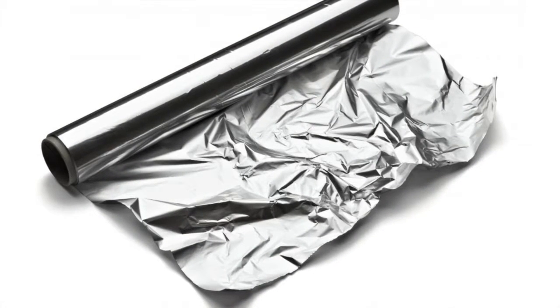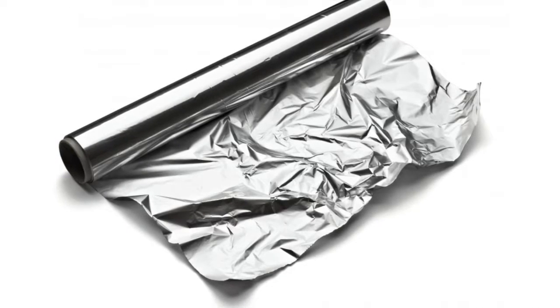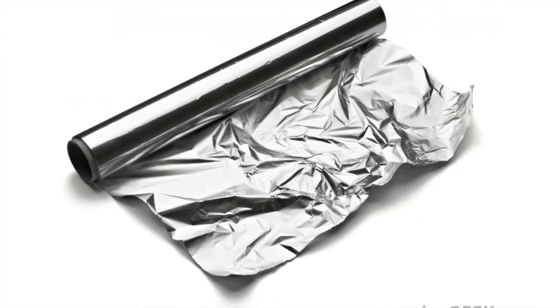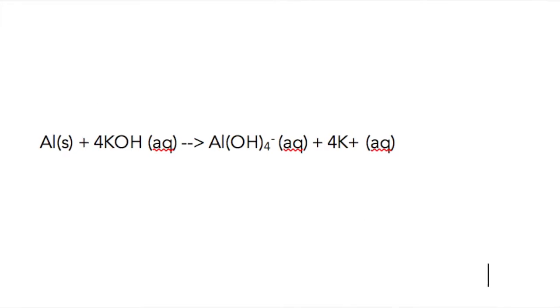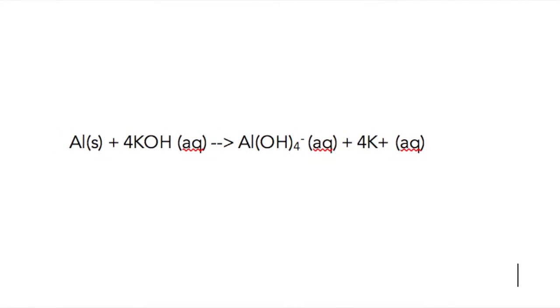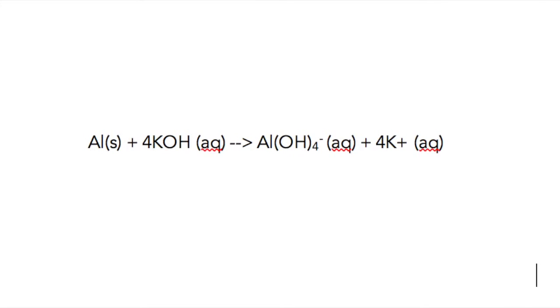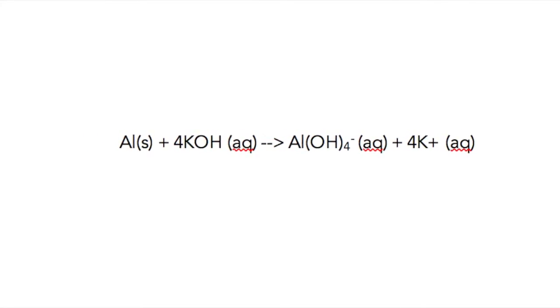To make alum crystals, we first needed a source of a required element, aluminum. To supply this, we dissolved a gram of aluminum foil in potassium hydroxide solution. This released aluminum ions into the solution, which immediately bound to other hydroxide ions in the solution from the potassium hydroxide. A solution containing potassium ions and aluminate ions was ultimately created.